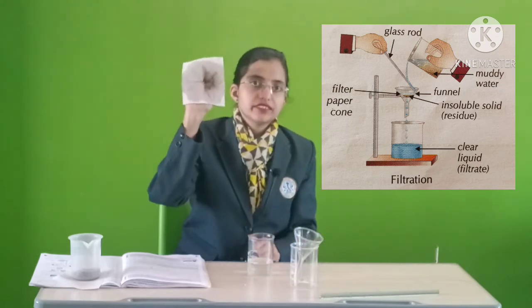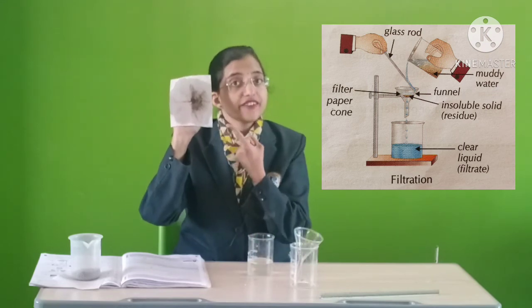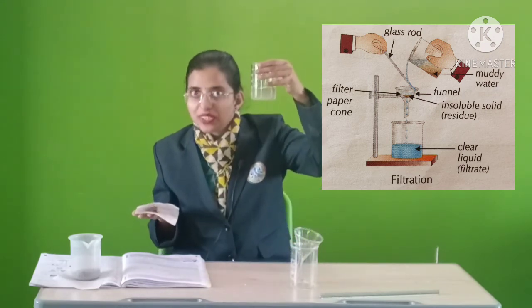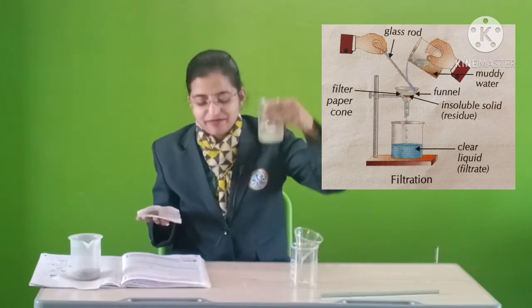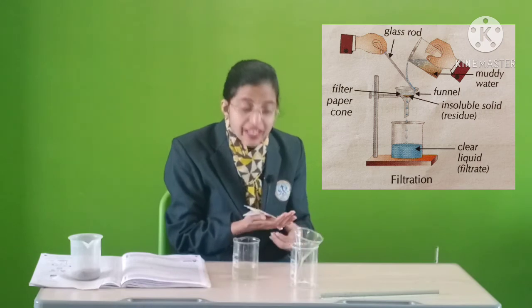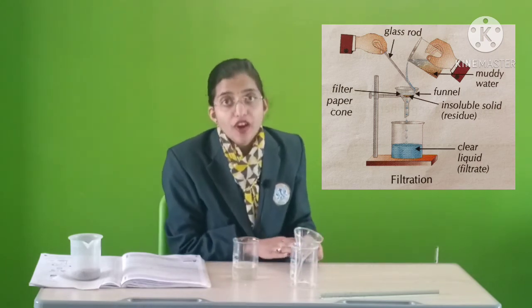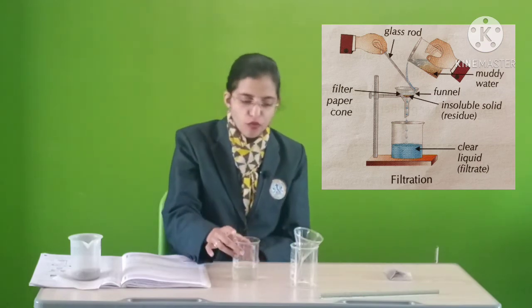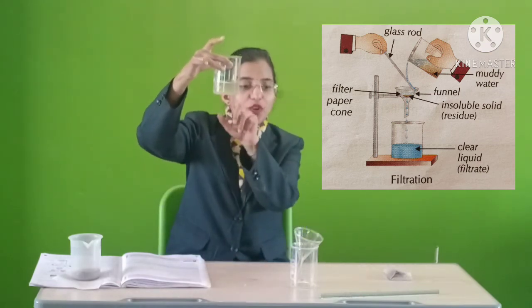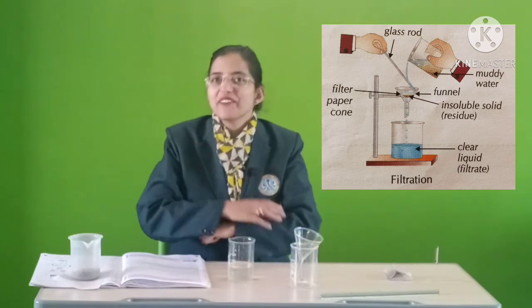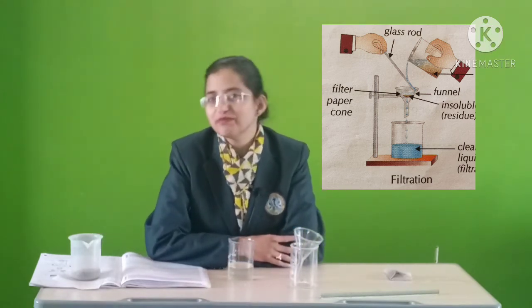See children, this is our cleared water — filtrate water. This is how we can remove insoluble impurities from water. Kids, for today this is our class. Study very well, be happy, keep smiling. May God bless you, my kids.